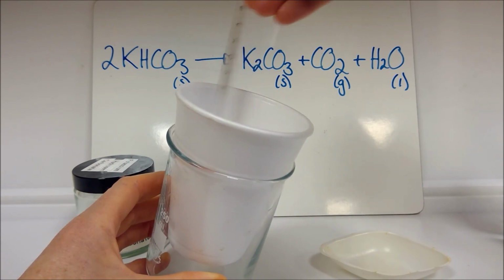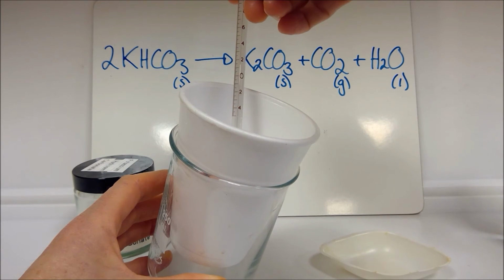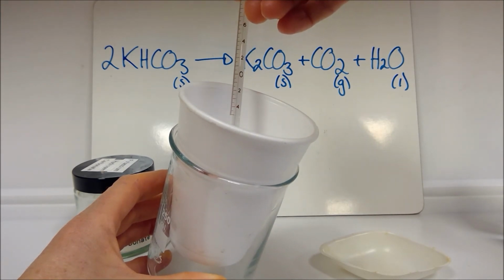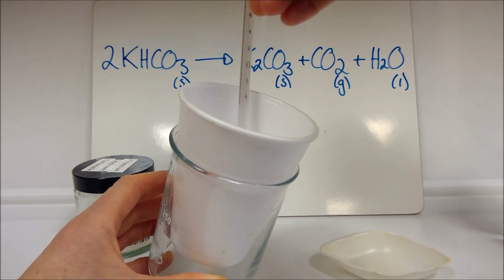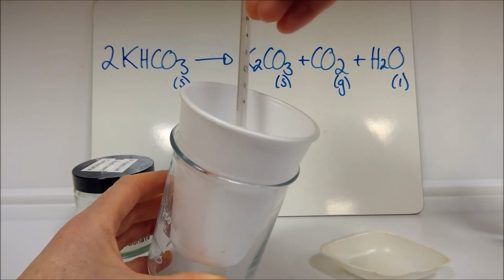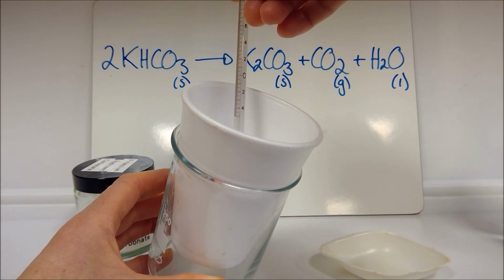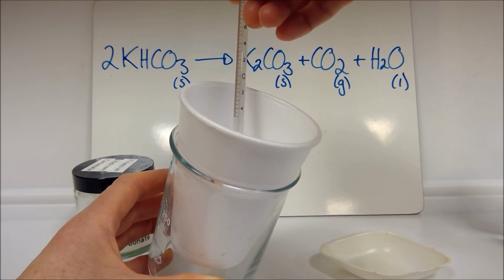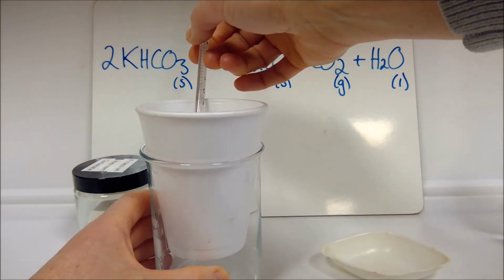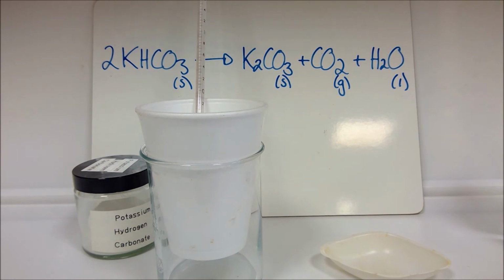And as I was saying before, these are going to then be recorded in the photograph at the end of the video. So this one has gone up to about 22 there. Just monitoring. So it's bang on the 22 line at the moment. And then it's stopping, I think, and starting to come back down. So I would be recording that one to 22.00 degrees. So it needs to be the two decimal places with those 0.1 graduations.